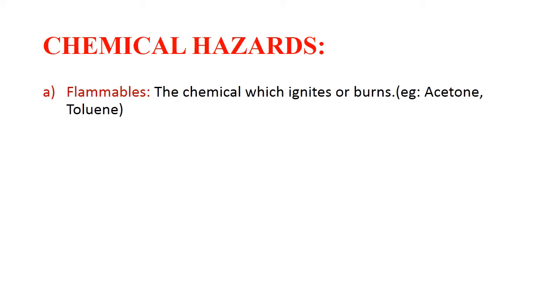Chemical hazards — these are of various types. To start with, flammables: chemicals which ignite or burn. Examples include acetone and toluene. The container is marked with a specific logo if it falls under the category of flammables.